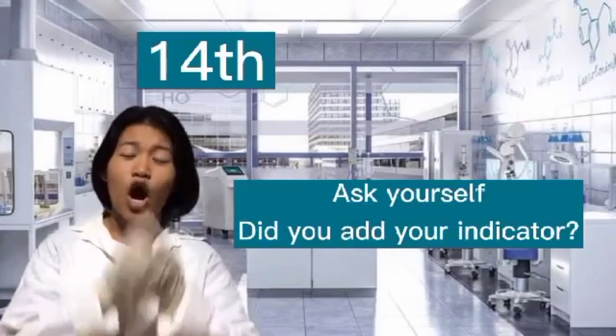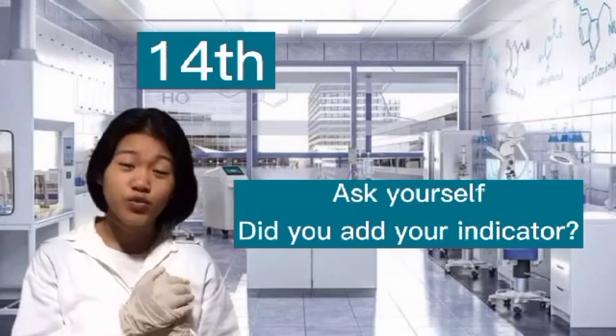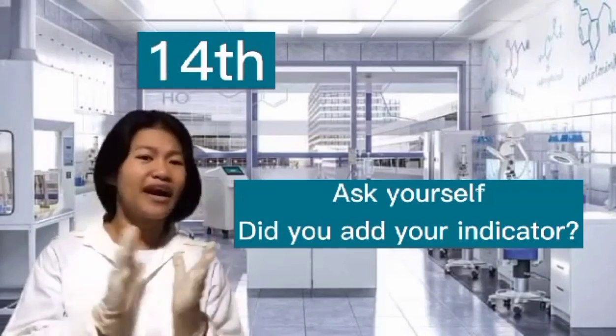Number 14. Always ask yourself upon doing the titration, did you add the indicator?